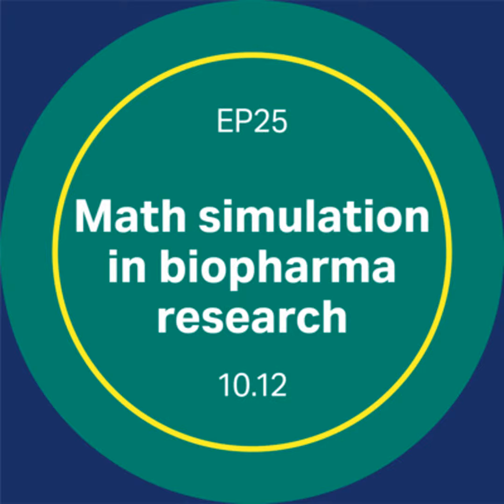Exactly what I asked Gunnar, and he says it comes down to that threshold. The fact is, there's a pretty steep learning curve to get to the point where you feel familiar and confident in doing this. The equations involved are rather complex. It's partial differential equations. It is currently described in a language that may not be the typical chromatography language.